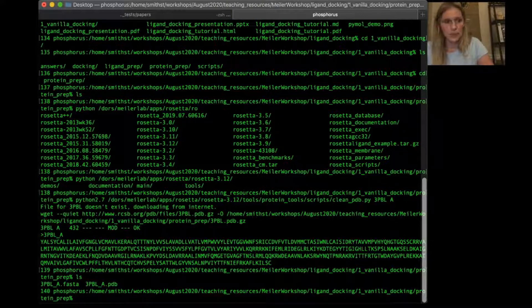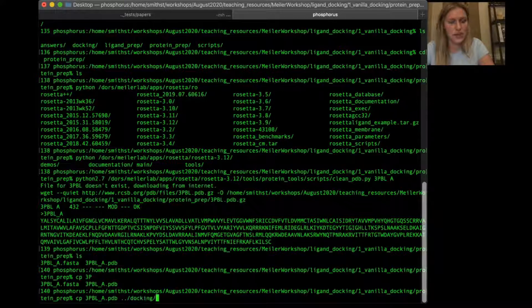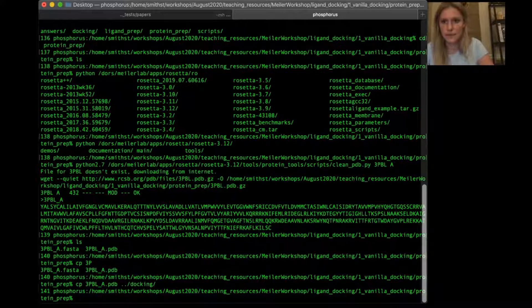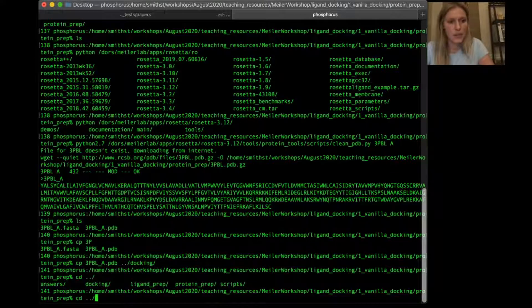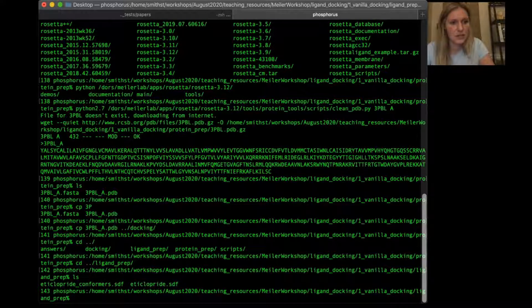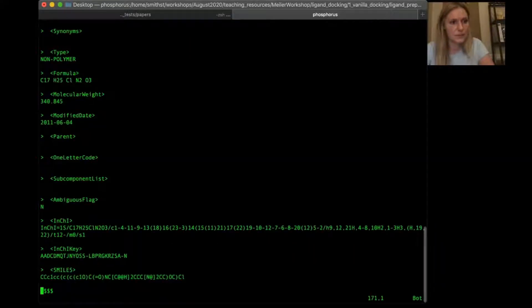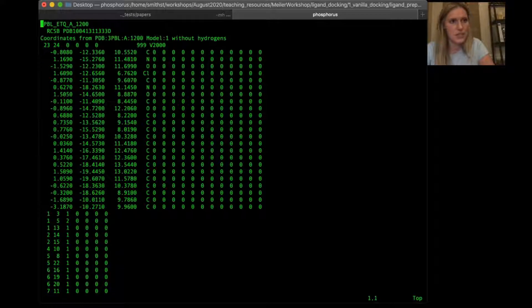We're going to copy this cleaned PDB file, 3PBL_A.pdb, into the docking directory. Then we'll cd back up a directory and into the ligand prep directory. If we ls in here, we already have an SDF file of our ligand. If I open this up, this is a standard SDF file with some information — it was taken straight from the PDB.